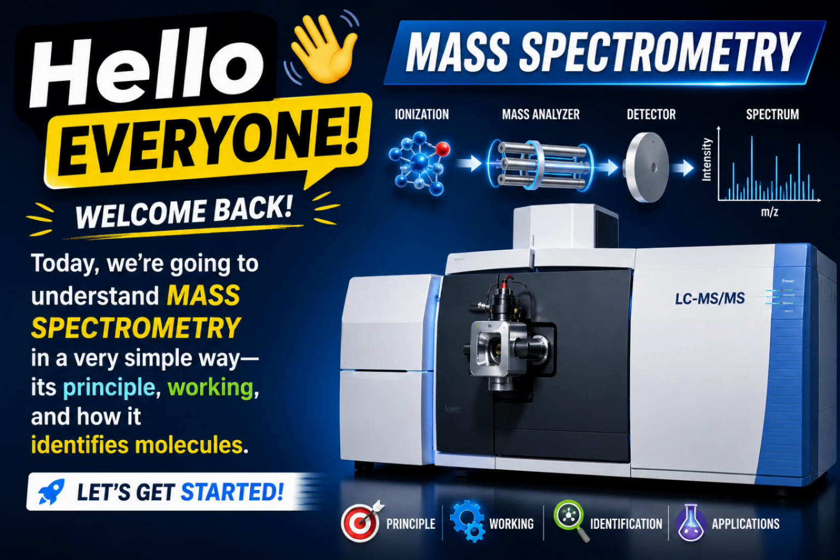Hello everyone, welcome back. Today we are going to understand mass spectrometry in a very simple way. Its principle, working and how it identifies molecules.